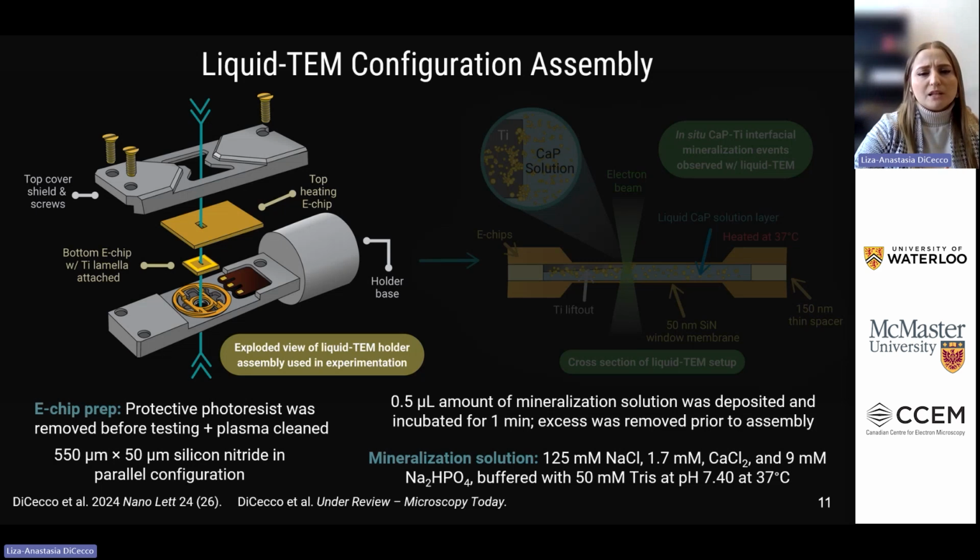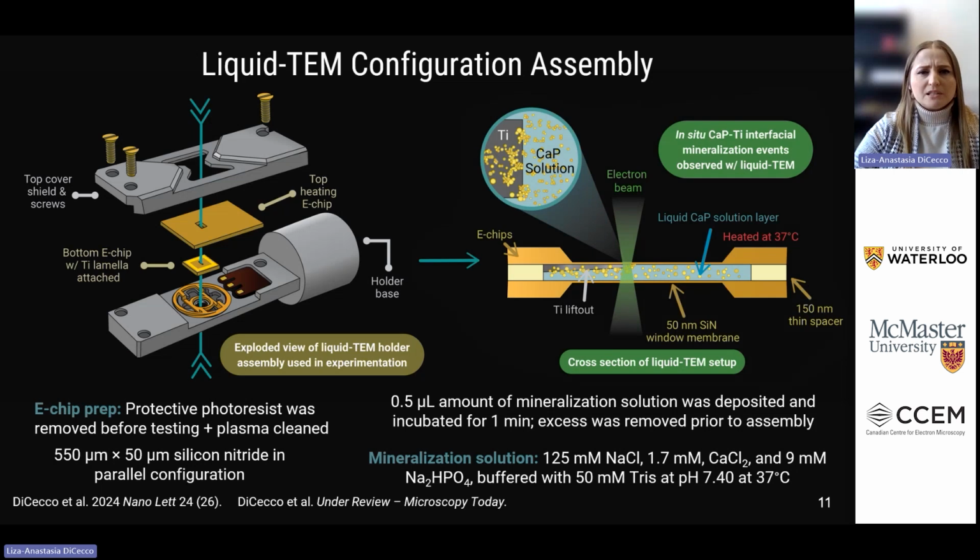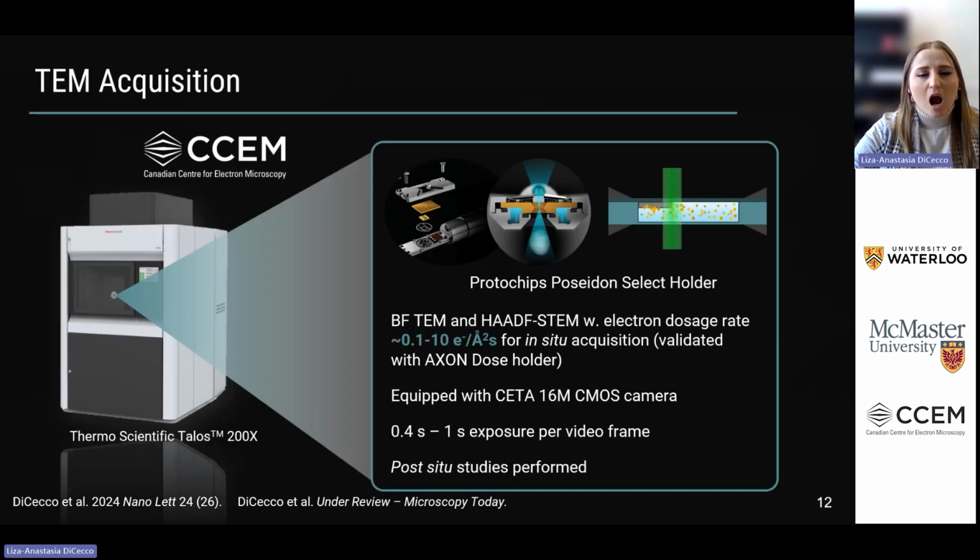We are using a mineralization solution that we have experience studying quite a bit. This is described in our papers. But in any case, this is the configuration, what the cross section looks like, and pretty much we've got that lift out, poking out on the side, and that's really where our focus area is.